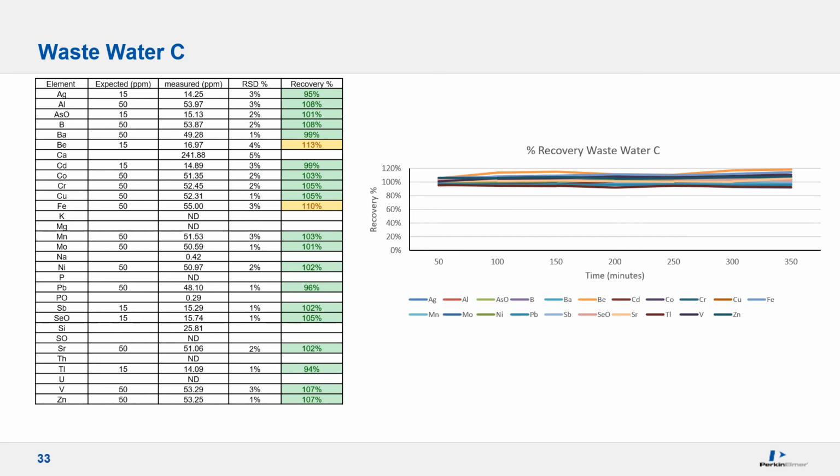The same 4 certified reference materials were analysed over the same time period on the NexION 5000 as they were for the Avio 500. This time, the samples were analysed 9 times overall. So each mean or averaged recovery and RSDs are over 9 measurements.